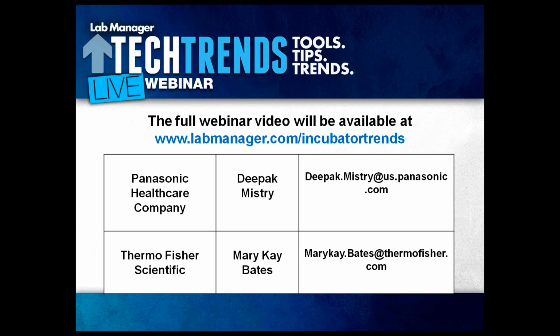So my advice would be, as researchers, when I was in the lab, I wasn't an expert, of course, in all these types of technologies, but I think it's come to the point where if you're putting an investment in an incubator or several incubators, it's worth getting a good explanation from the manufacturer on how those sensors are developed, why they're more reliable than the other, and also why they're more precise.